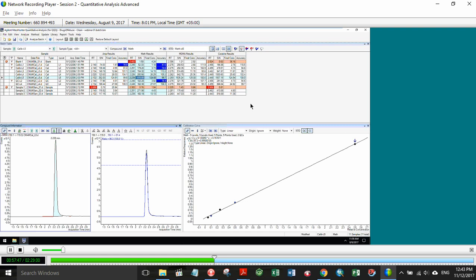The calibration curve, right? We have 5 levels used here, 5 points used. The question then would be, is this variable available in the batch table somewhere? The 5 points used, 5-point curve there. I'm going to have to look into that a little bit more. Off the top of my head, I can't remember.